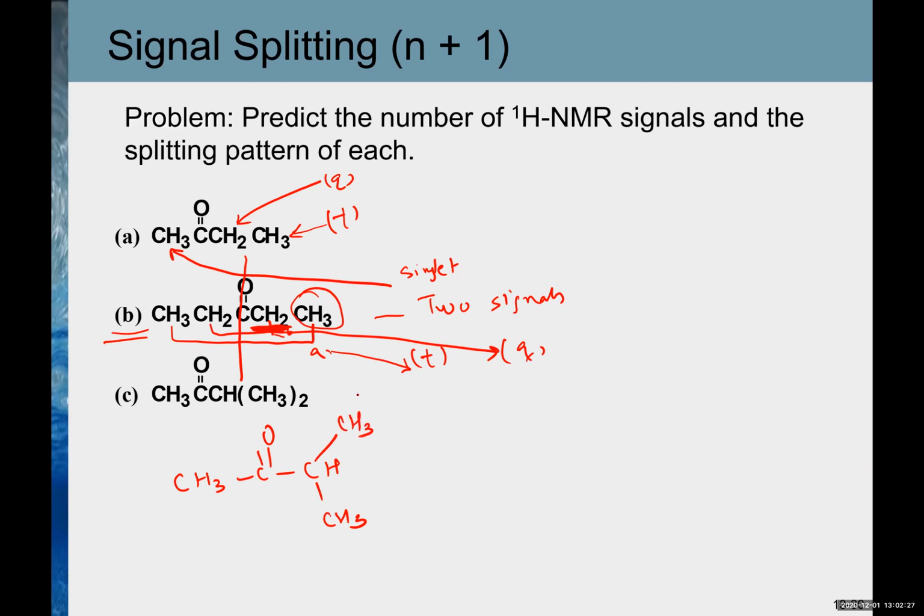What will be the multiplicity of this signal? Let's call this A. Singlet, right? Yep.